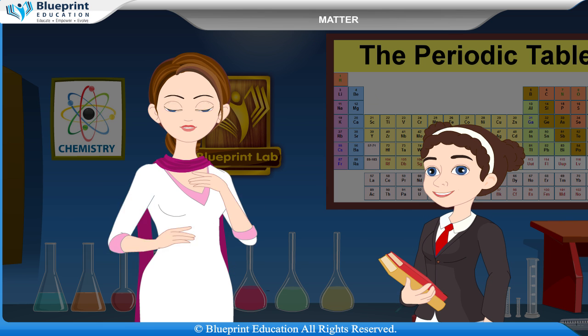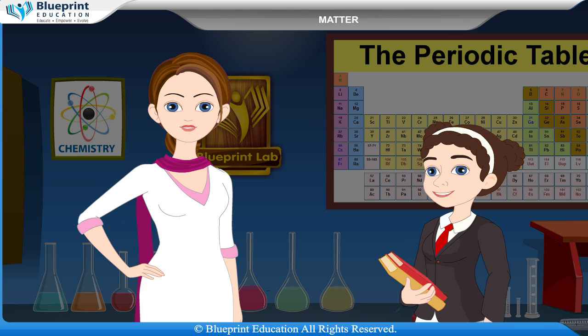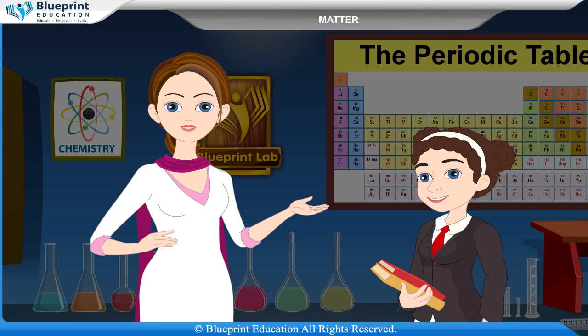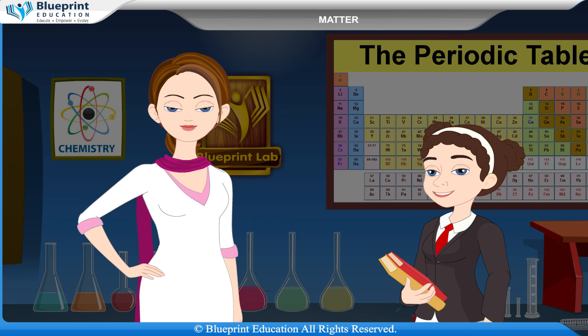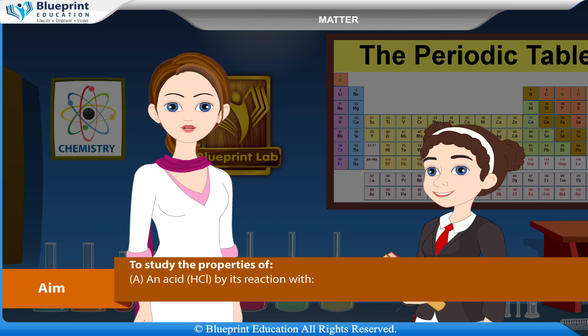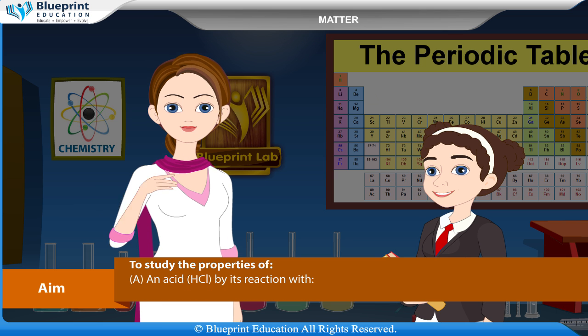A, an acid HCl, by its reaction with litmus solution blue and red, zinc metal, solid sodium carbonate. B, a base NaOH, by its reaction with litmus solution blue and red, zinc metal, hydrochloric acid. Our aim is to study the properties of A, an acid HCl.